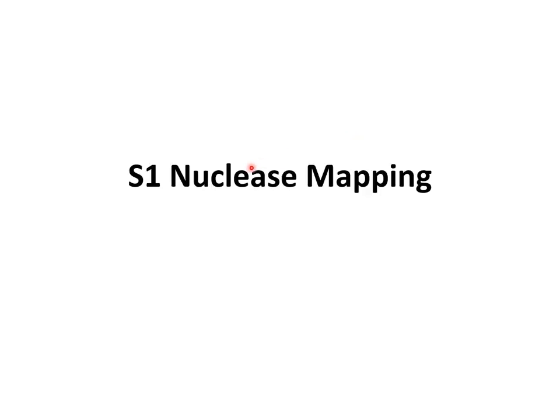Good afternoon, students. I'll be teaching you today about S1 nuclease. Since all of you have taken the biotics paper, I have very few topics to teach you. One of these topics is transcript mapping, and it is about S1 nuclease mapping.